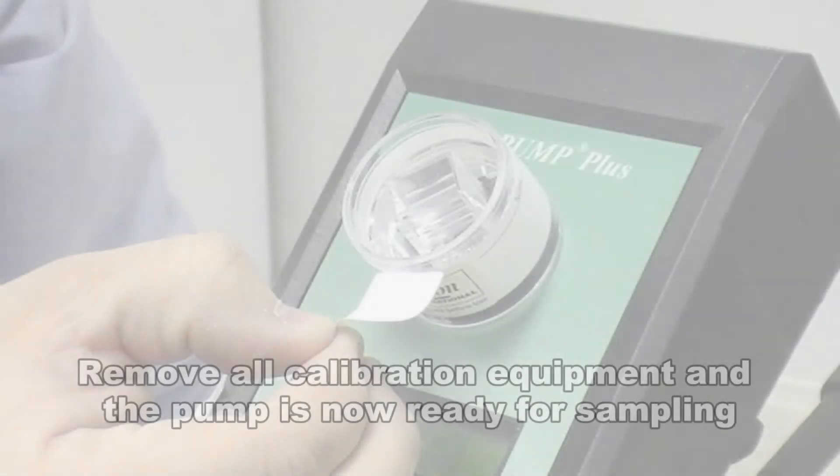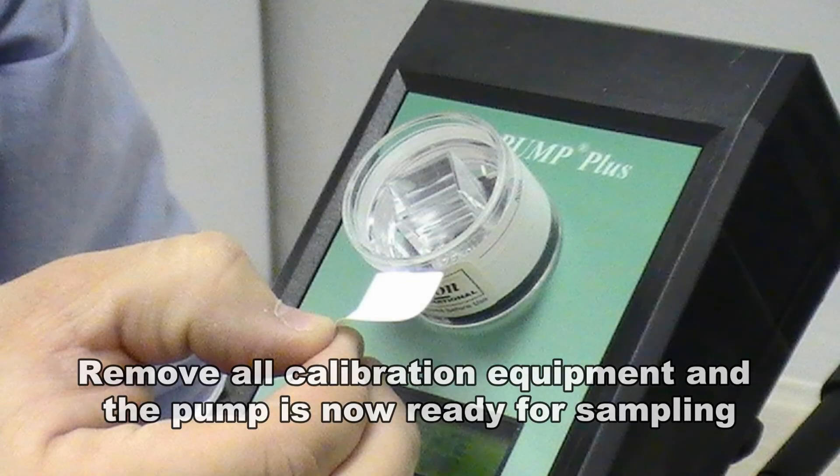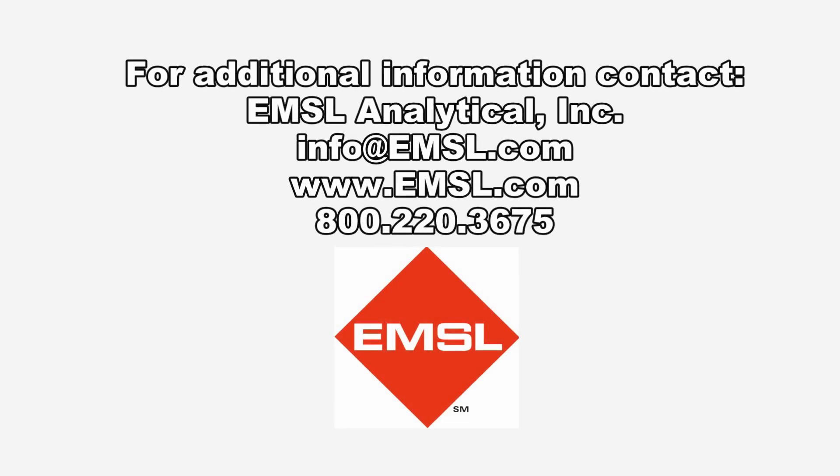The pump is now calibrated according to the primary standard and you are now ready to begin sampling. For more information, please contact EMSL Analytical.